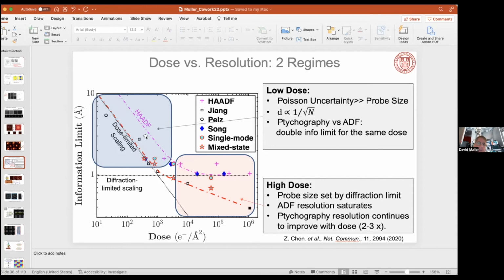Now, what people have done with cryo-EM is they're down to about an angstrom resolution in their single particle reconstructions already, which, 5 years ago, was 2 angstroms, when they were competing with X-rays. Now you're at an angstrom. It's just kind of crazy. So I don't know how much better we would do, because the dose scaling, to get enough particles reconstructed to have enough information at those high angles, is square root, which is not a great scaling. So we may not be that much better that people would care about it at atomic resolution.